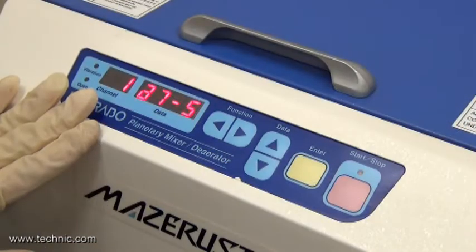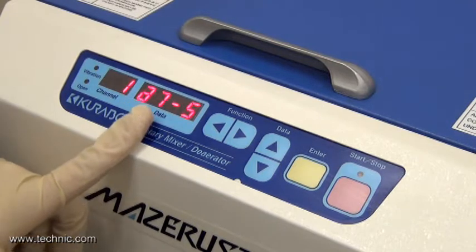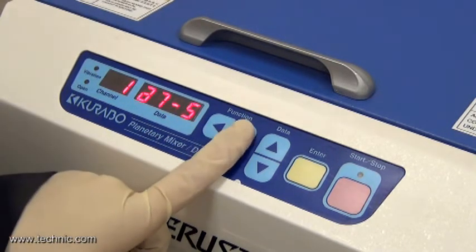Then, we will program the mixing speeds and time. For step A, the revolution speed is 7 and rotation speed is 5 for 1 minute.